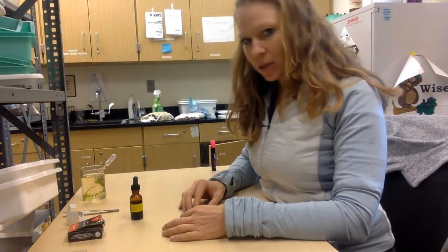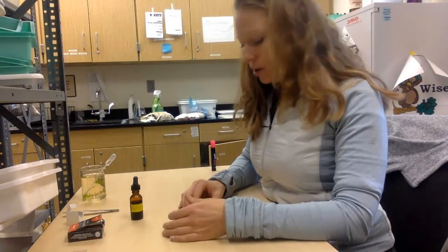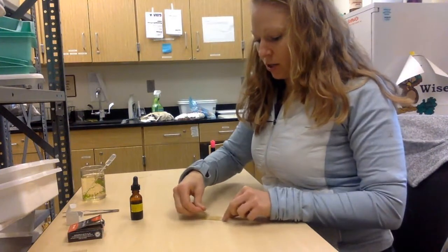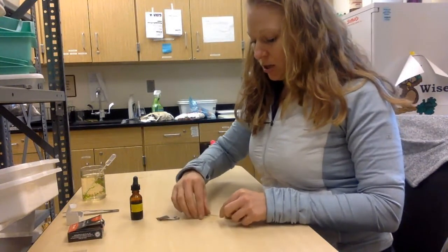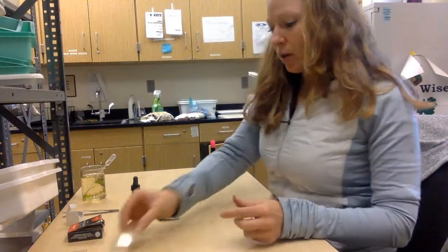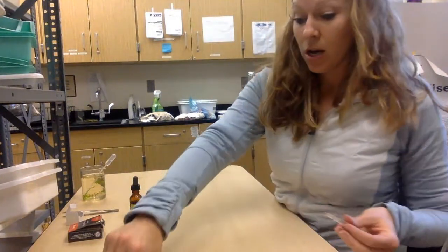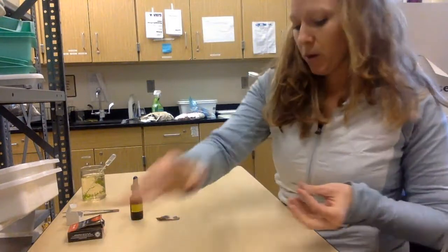We use this method to try and eliminate air bubbles under the cover slip. They do happen, and they're pretty apparent. They look like big black dots. And so here is your wet mount of cheek cells. Next, after you're done with that, you would wash that slide, and you would use that slide again for the next part.